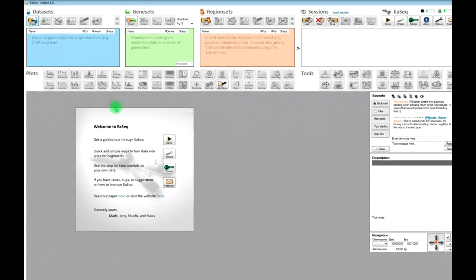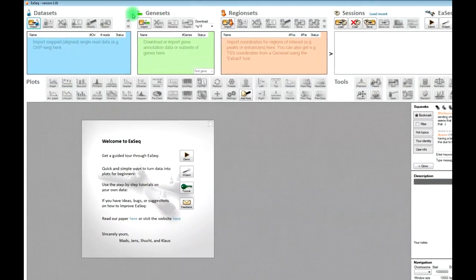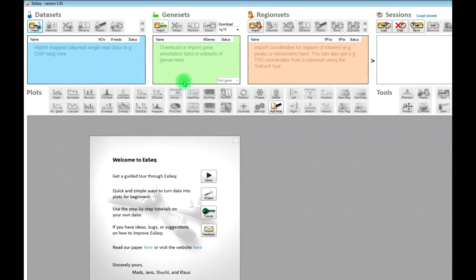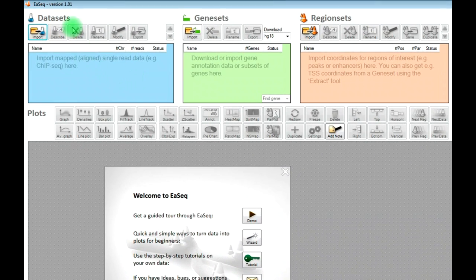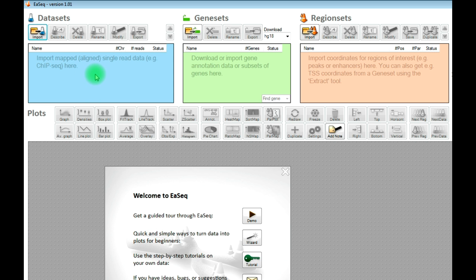In EASEQ, we have three different types of data presented in three panels: datasets, gene sets, and region sets. The datasets are your ChIP-seq experiments — they can also be RNA-seq, RIP-seq, methylation data, or something different. But they need to be mapped, i.e., aligned to a reference genome before you can import them, and they also need to be single-read data.